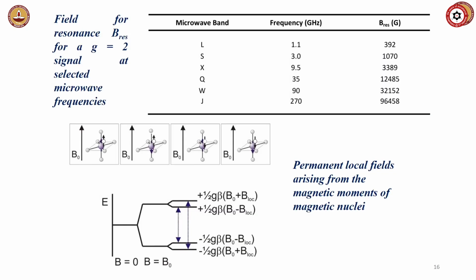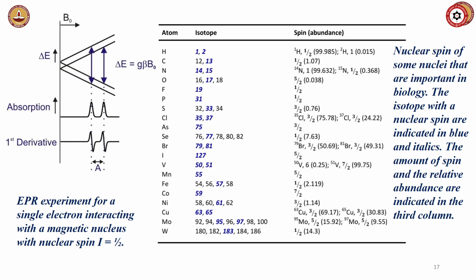So this is the physical meaning of the g, and these are all the nuclei, you can see how much spin and difference they have. I told you, in carbon you have only nearly 1% of the 13C, so that's why I gave you these values, 99, 100 and all, and that is why satellites are coming.